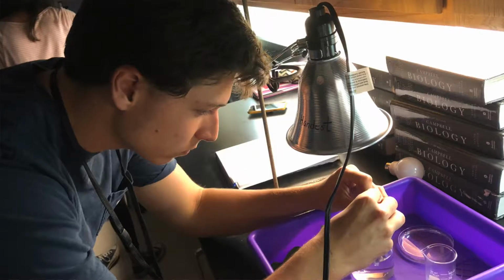Then we created a vacuum, which means that we took the excess air out of the chads, the little pieces of leaf. That way we can make room for the water to come into the chads, so that they can sink to the bottom of the syringe.